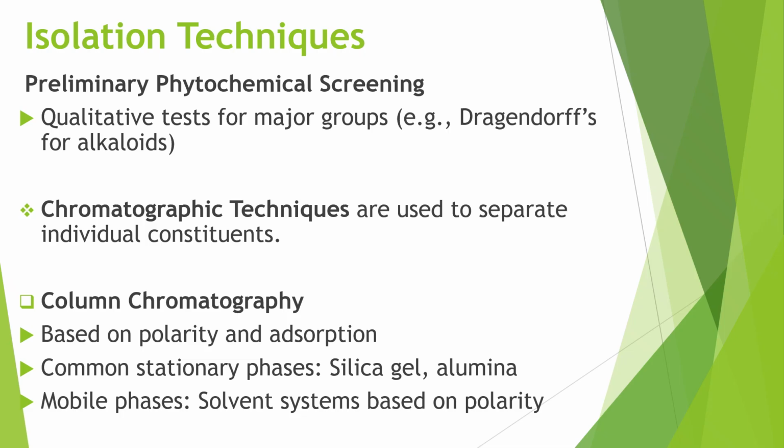Commonly, stationary phases are made up of silica gel G or alumina. The mobile phase can move, whereas the stationary phase is fixed. So a solvent system must be there, and it is based on polarity. It must maintain coordination between the extracted product and the used solvent.